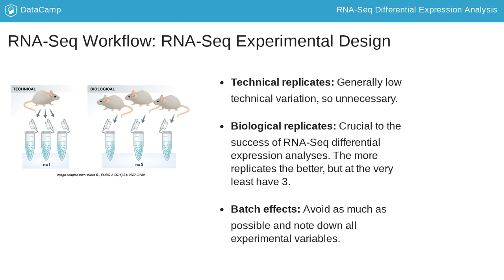Finally, avoid confounding your experiment with major sources of variation. For example, if your animals are of different sexes, don't have all male mice as control and all female mice as treatment, as you won't be able to differentiate the treatment effect from the effect of sex.